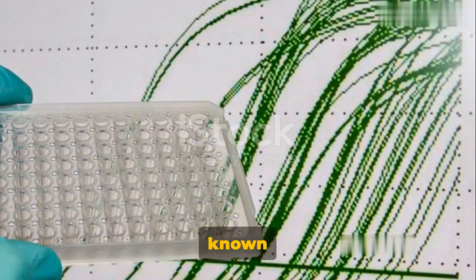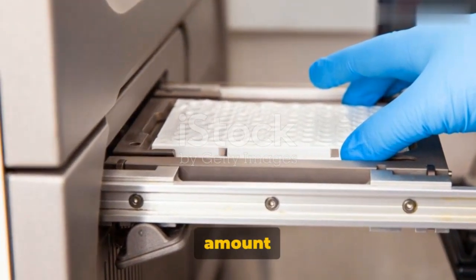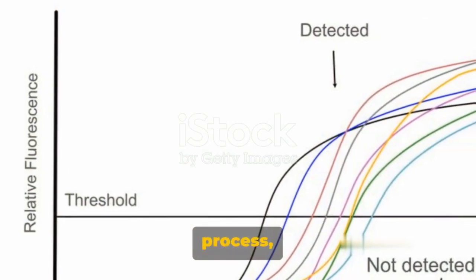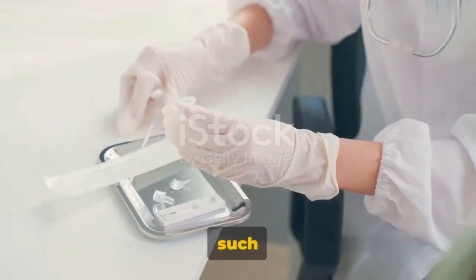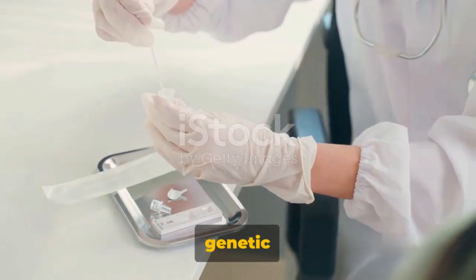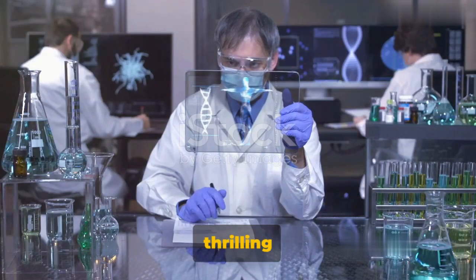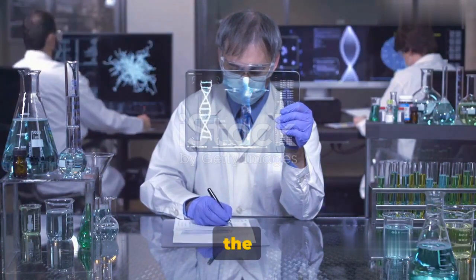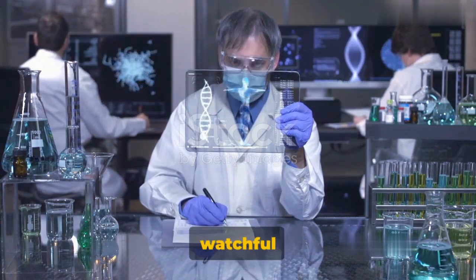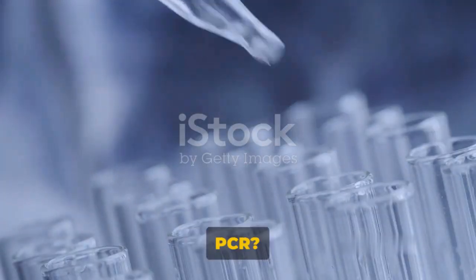Real-time PCR, also known as quantitative PCR, not only amplifies DNA, but also measures the amount of DNA amplified during the process, all in real time. This makes it an invaluable tool in various fields such as disease diagnosis, genetic research, forensic science, and much more. It's like watching a thrilling play unfold, where the DNA is the main character and the enzymes are the supporting cast, all under the watchful eye of the real-time PCR machine. So, are you ready to unravel the mystery of real-time PCR?